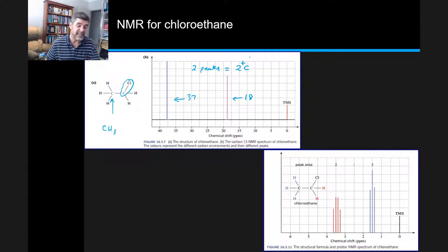Interestingly, if this was ethane rather than chloroethane, you would notice that carbon-chlorine bond would disappear. We actually have symmetry then, so each carbon would be bonded to another carbon that's bonded to three hydrogens, and you would not see both of these double peaks in these two outputs.